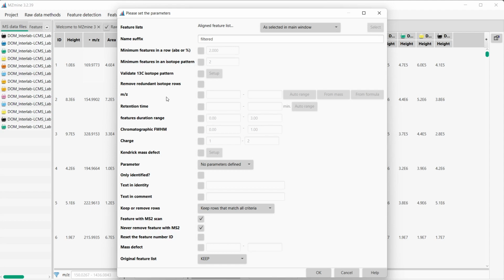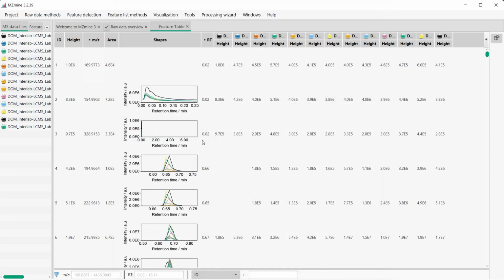And then later, once it's implemented, people are going to see it directly, even without advertisement, even without people telling them to look for it. They already use this module. So they might see there's a new parameter and they can just activate it and read about it in, of course, the help, which is the online documentation where you can just add it.